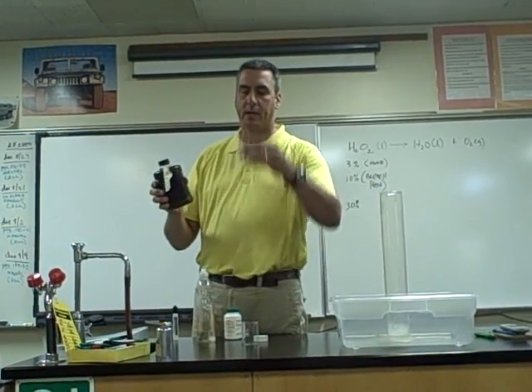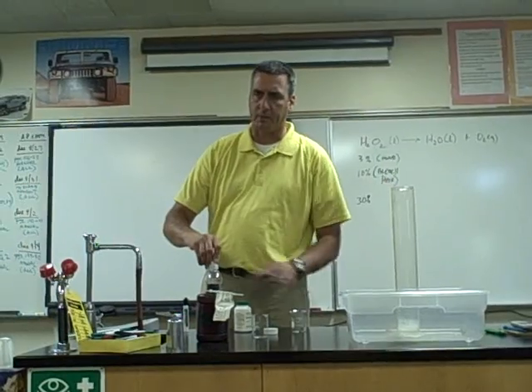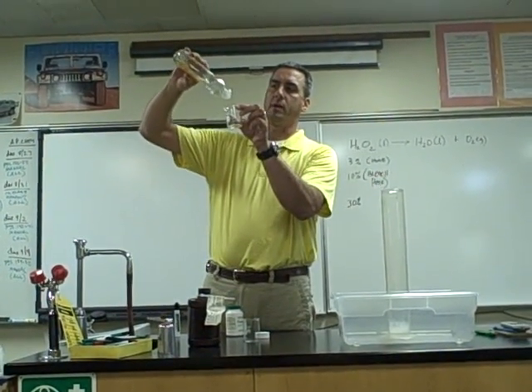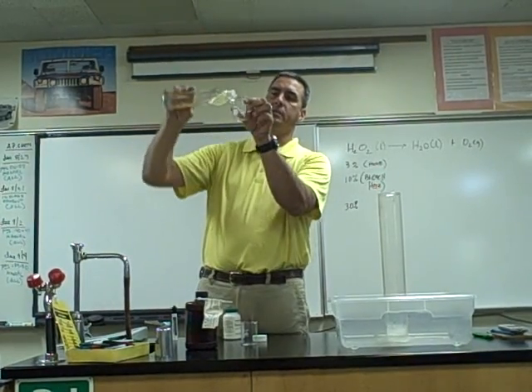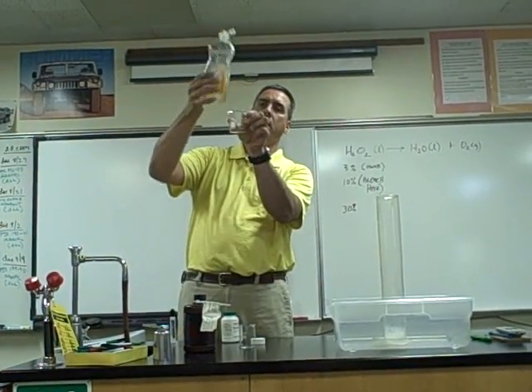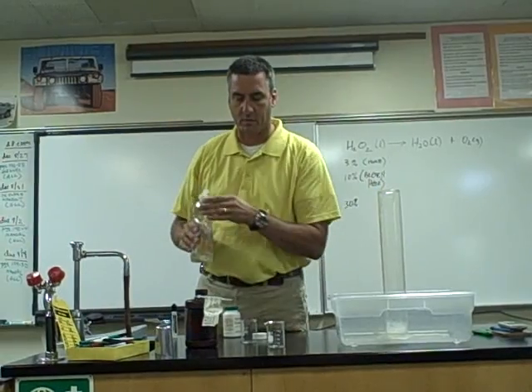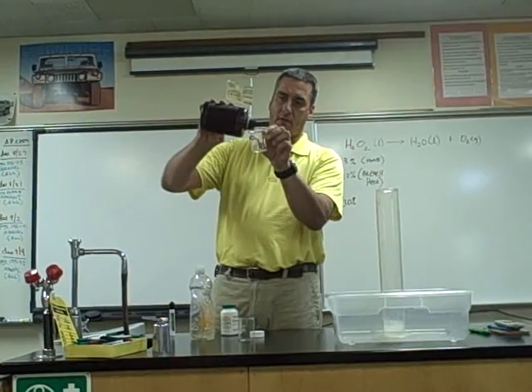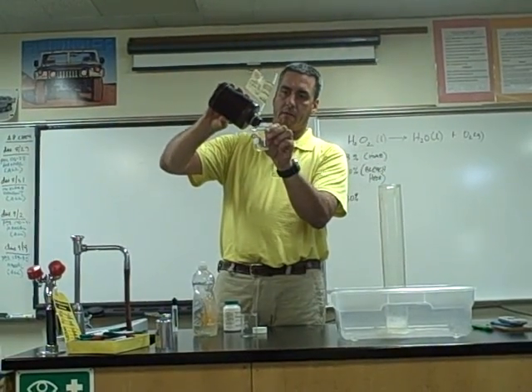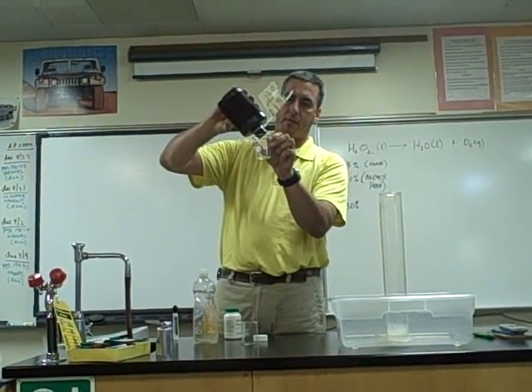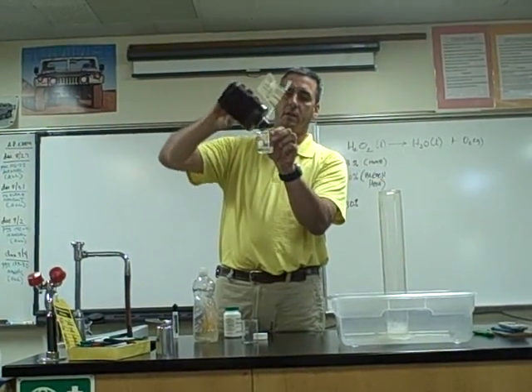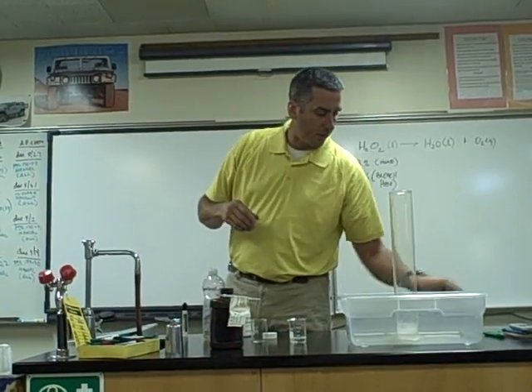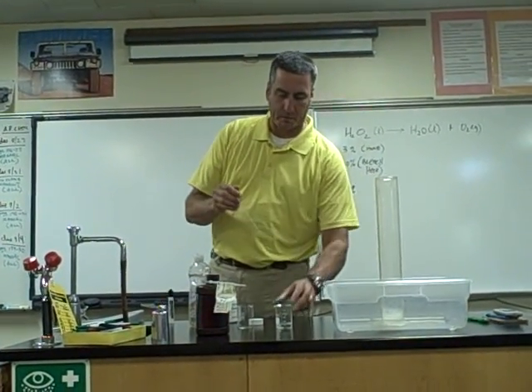I'll take some of the 30% peroxide and put a few drops of dishwashing soap in here. We really won't use too much, just a little bit. That's plenty — more than your moms would ever use at home. We'll put maybe 15 or 20 milliliters of peroxide. We don't have very much of this left, so you guys are probably going to be the last class to see this today. We'll stir this baby up with a stirring rod.